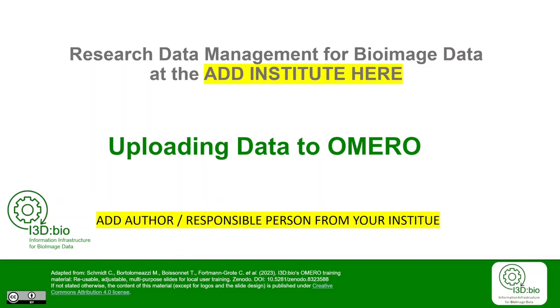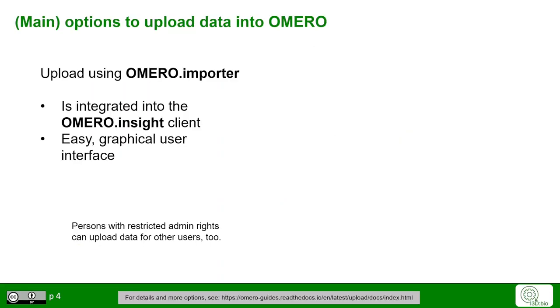Let's explore how data is uploaded to Omero. There are several options to upload data to Omero — here we introduce the most important ones. The typical way would be using Omero Importer, which is integrated into the Omero Insight client that users install on their computer. It offers an easy and graphical user interface.